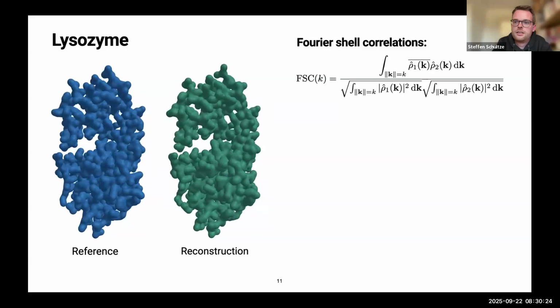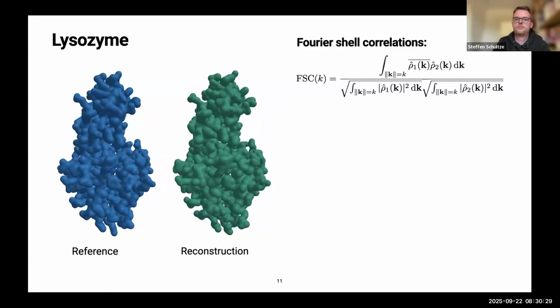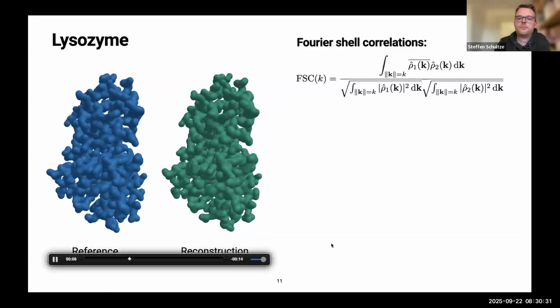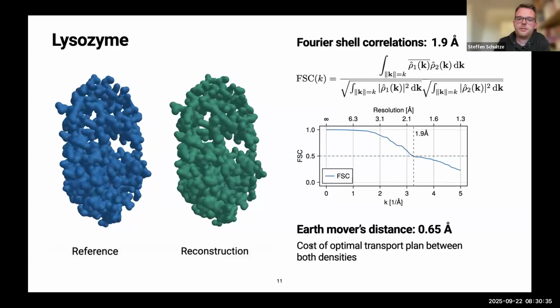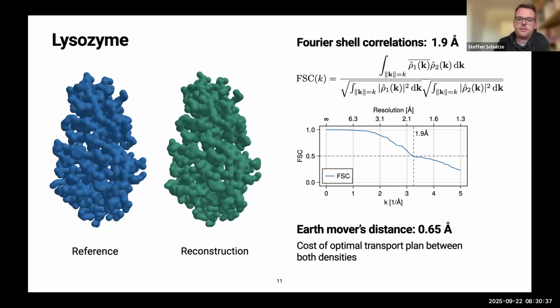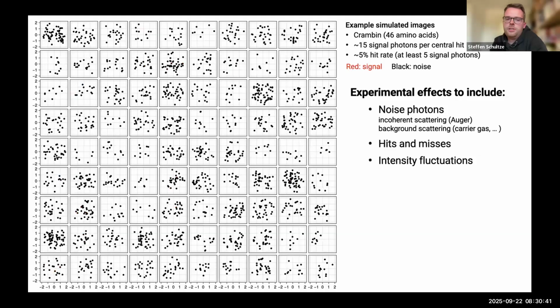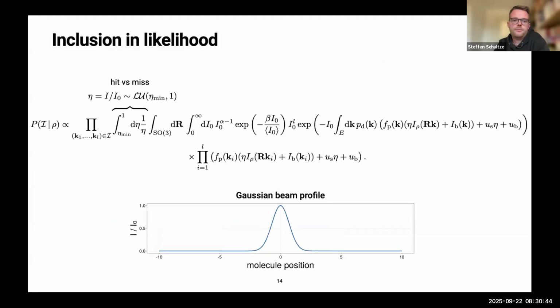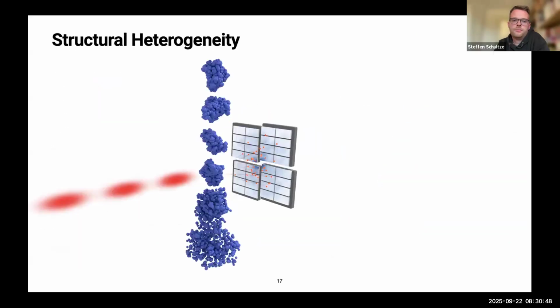In your Chignolin example, you had 3 states as your prior. How did you determine that? You had a folded, unfolded, and an intermediate, I think, right? Yeah, sort of. Chignolin does have these 3 states. This is not something we have included as a prior at all.